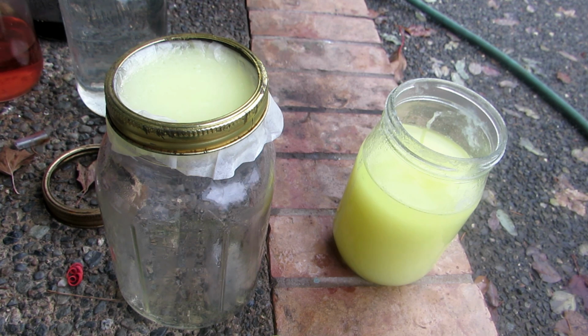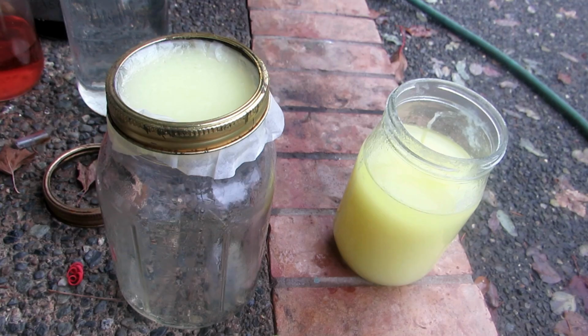The camera's not really picking it up too well, but I can clearly see the silicic acid gel complex type stuff, which has formed. So I'll finish filtering off all of this, and then I guess I'll let the silicic acid go out and dry. So I'll meet you back in a moment.